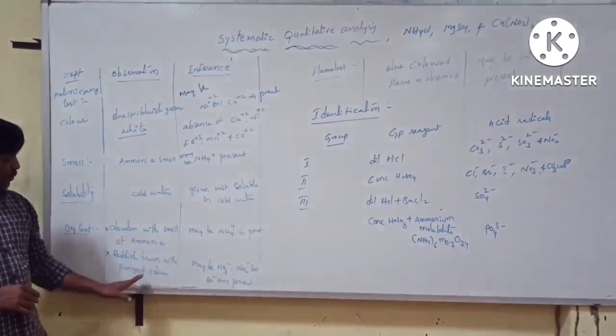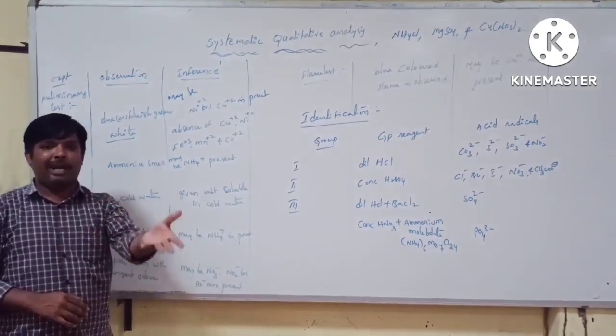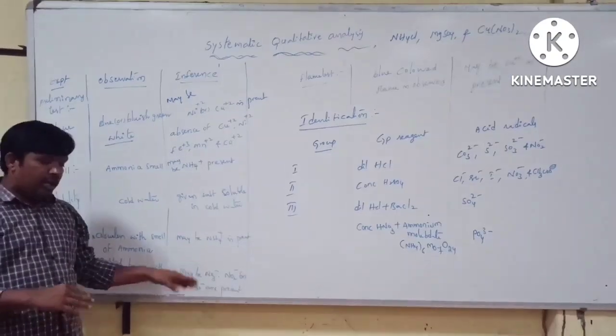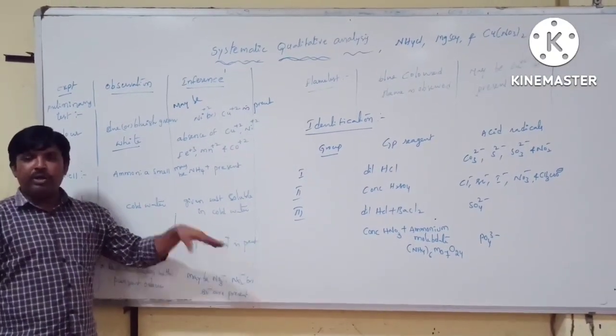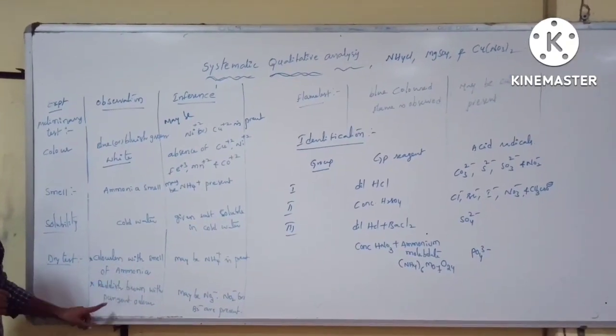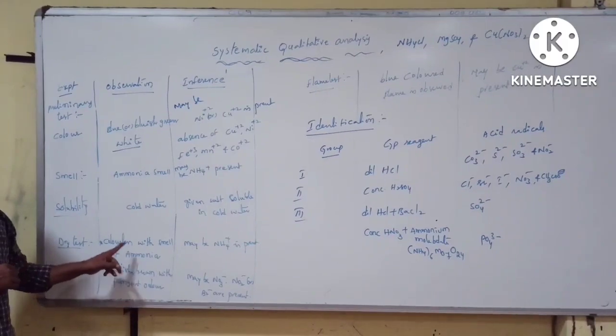Ammonia: reddish brown with a pungent odor. There may be the presence of nitrate ion. ఈ రెండు కాకుండా ఏముంటుంది సార్? ఇది రెండు కాకుండా ఏమున్నా కానీ... అమోనియా రాలేదు, నీకు NO3 రాలేదు. రెండు కాకుండా ఏమొచ్చినా కానీ మనకు అవసరం లేదు కాబట్టి... మనకి అమోనియా లేదు, రెడ్డిష్ బ్రౌన్ వేపర్స్ రాలేదు అని అంటే అక్కడ మనం ఏం రాయాలి సార్? ఈ గ్యాప్ లో ఏం రాయాలి? What we have to write?